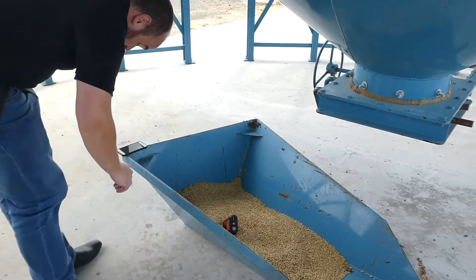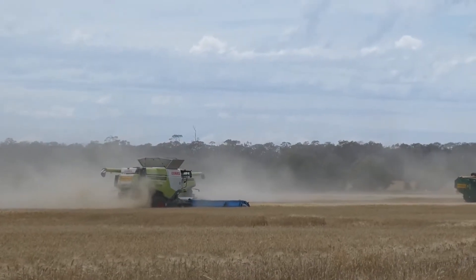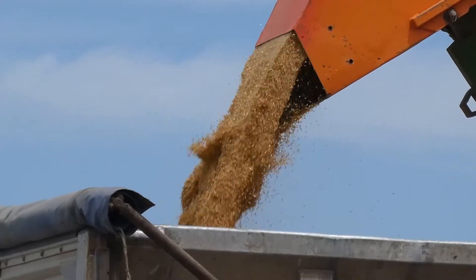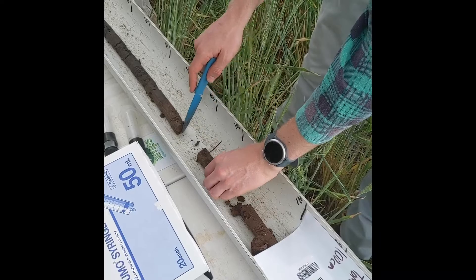The robust and solid build of the Hone Lab makes it ideal as a rugged on-farm device that can tolerate the brutal conditions of the Australian farm. Building Hone Lab called for a solution that was versatile, lightweight, and durable.